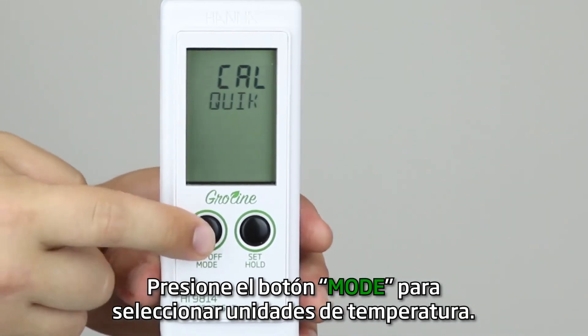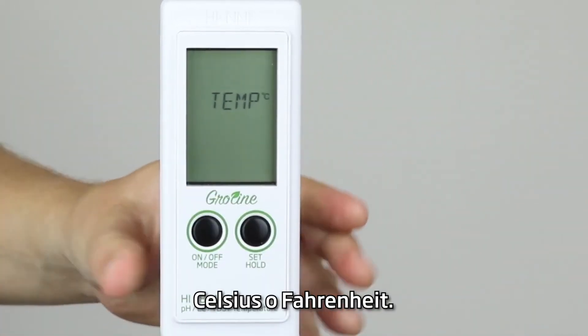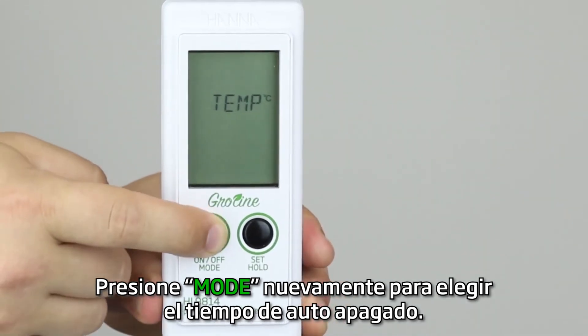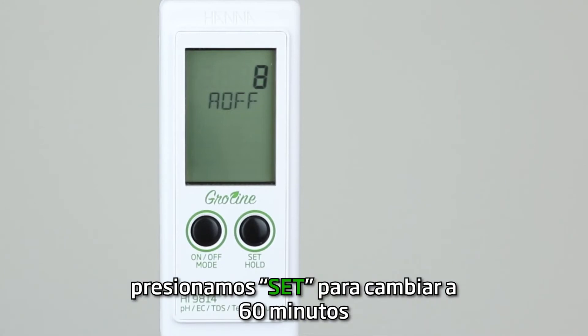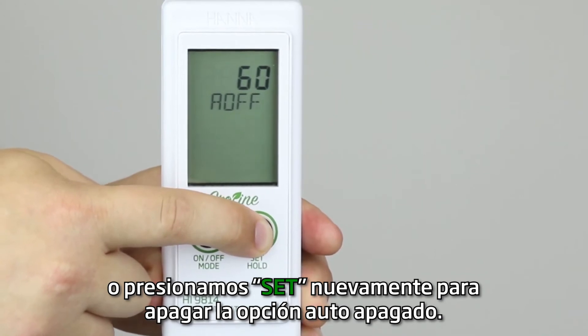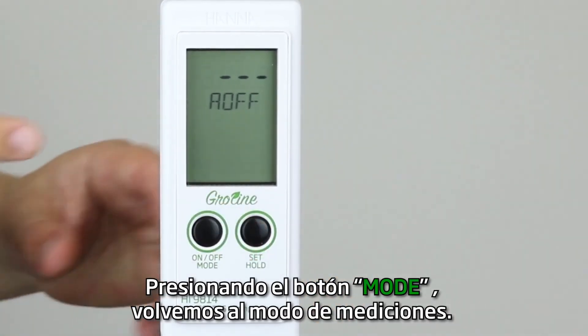Press mode to select temperature units. Pressing the set button changes from Fahrenheit to Celsius. Press the mode button again to set the automatic shutoff time. The default setting is eight minutes. Press set to change it to 60 minutes, or press set again to disable auto off. Pressing the mode button again exits back to measurement mode.